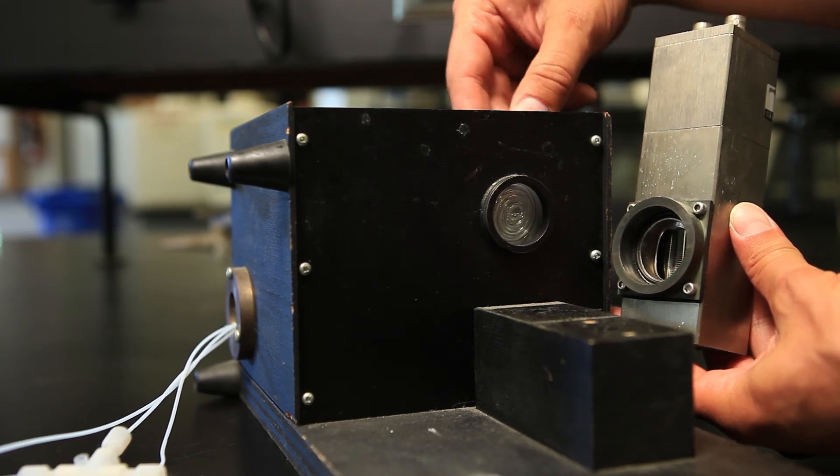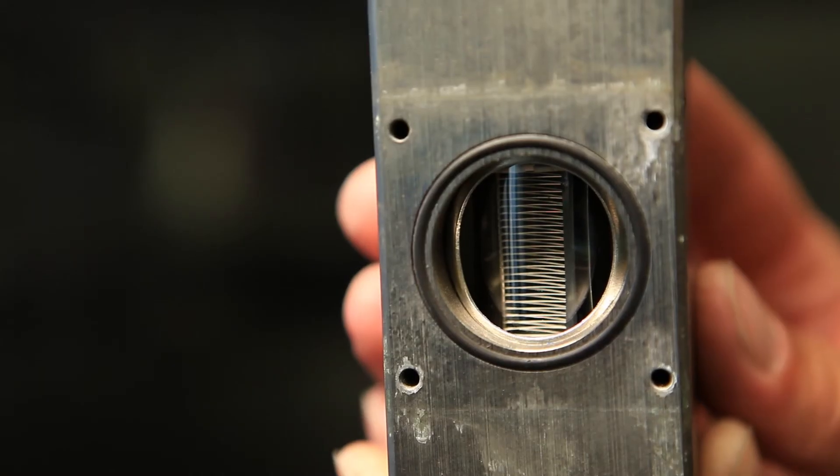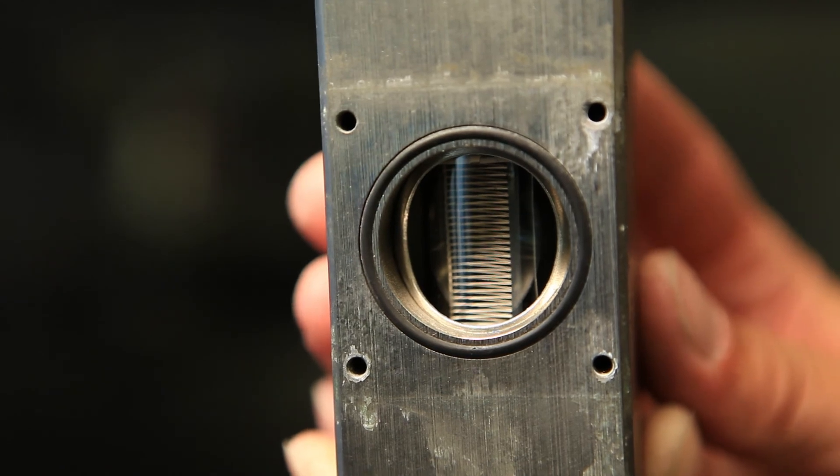The spiral coil is placed directly in front of the detector, to capture as many photons as possible. The detector in this setup is again a photomultiplier tube.